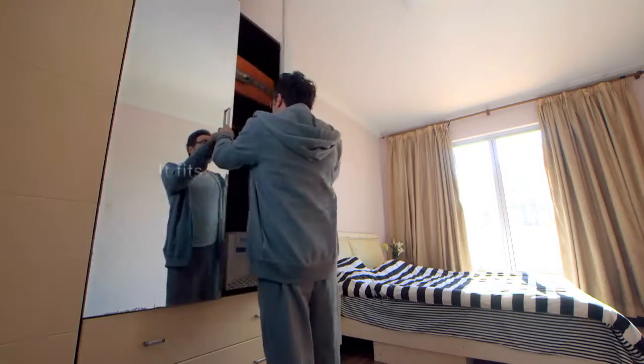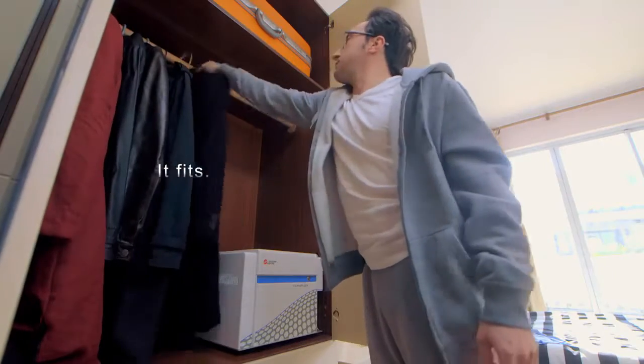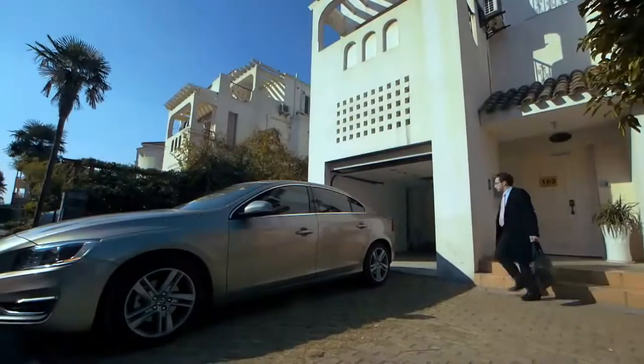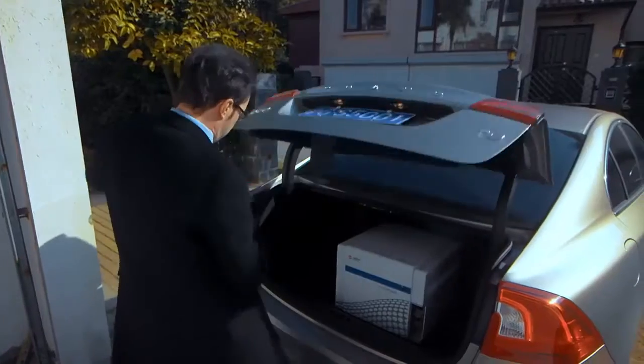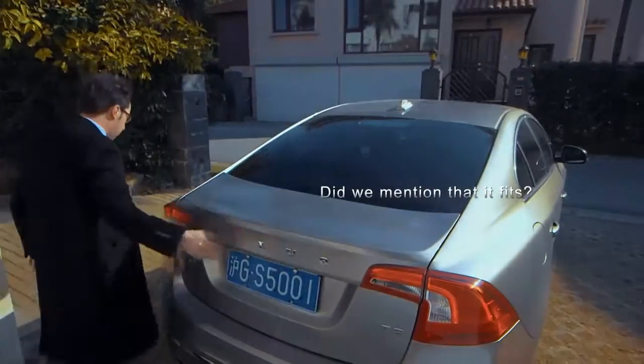So small it fits in places where you might think there's no extra room. So small, it's easily portable.